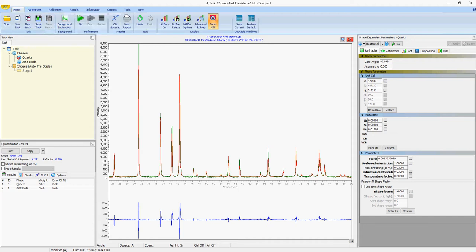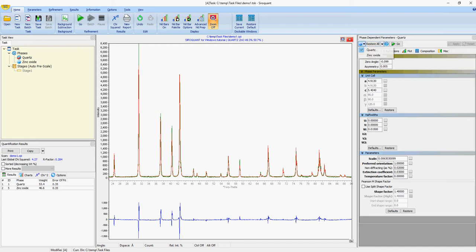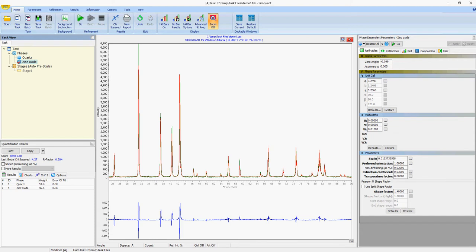So now that we've done our initial refinement, you can see that the quantification results window has been populated, which is down here. And you can also see on the right side the phase dependent parameters window, which shows the refinable parameters for each phase. From here you can either change the phase from this little box here, or by clicking on this window it will also change the phase to display it in that phase dependent parameters window.